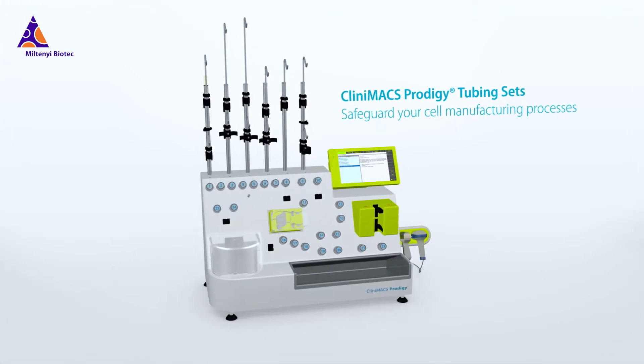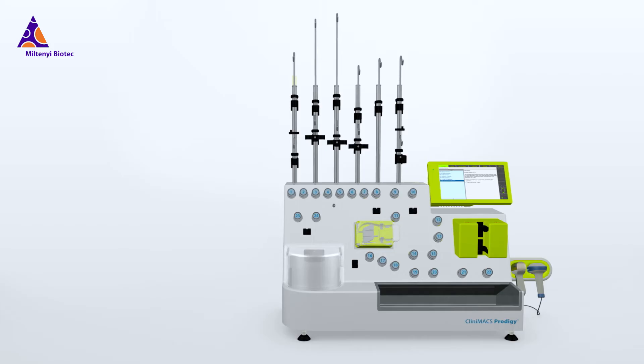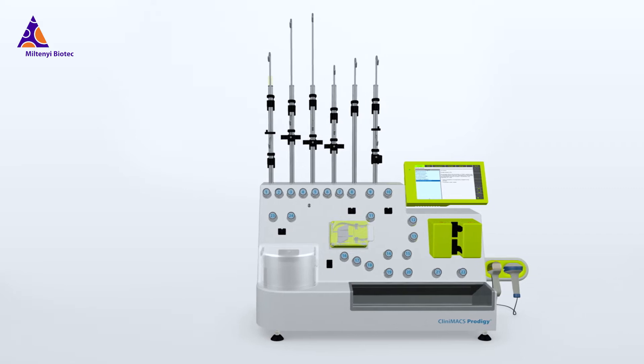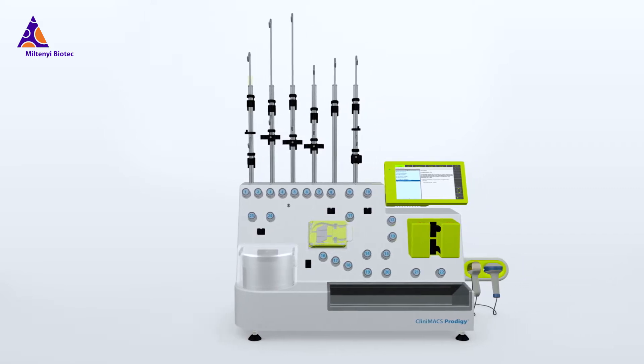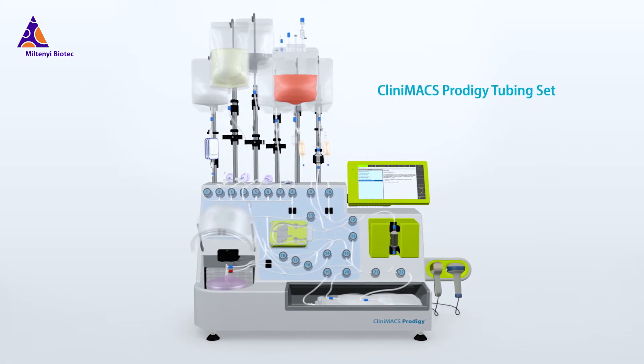The Clinimax Prodigy Platform for Cell Manufacturing is more than just an instrument. While cells are being processed, they are transported, washed, sorted, activated and cultivated within a single-use, sterile and closed tubing system — the Clinimax Prodigy Tubing Set.